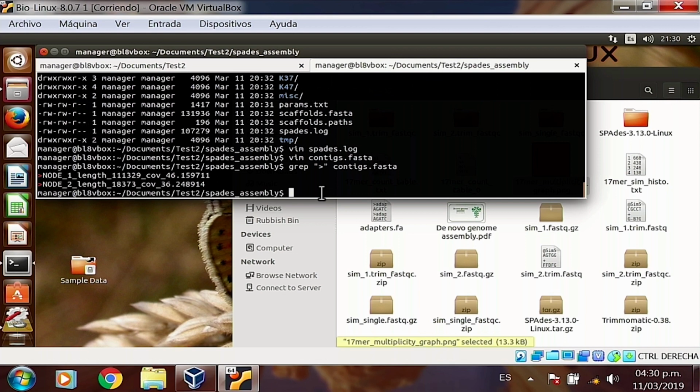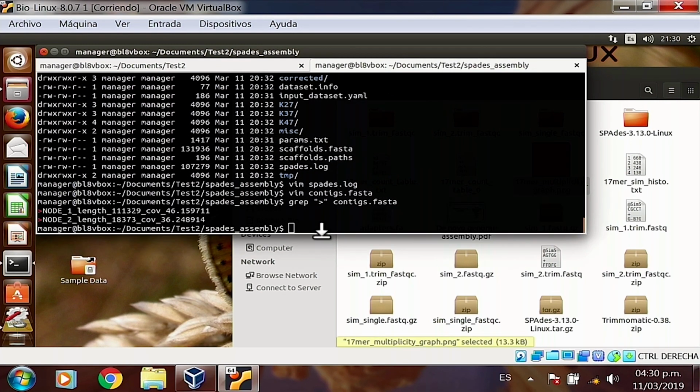So we have finished the assembly. We know what's the length of each of the contigs because of that, but let's assume that we don't. Then we have one of the most used tools in bioinformatics. For pretty much everything you want to do with sequences, you're going to end up using this tool. The tool is called SAMtools. I'm pretty sure that if you've read any papers about bioinformatics, assembly, etc., you must have run into the name SAMtools. It's written like this.